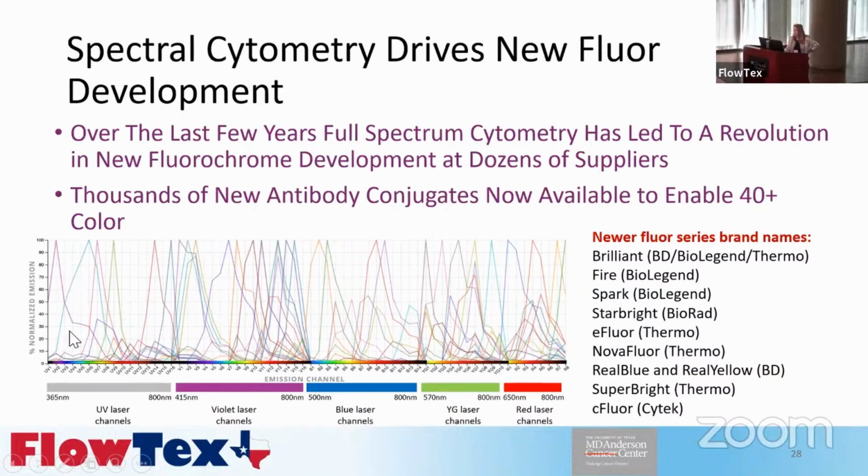And you can see that I'm fitting in quite a lot of dyes here. It wouldn't be obvious to anybody's eye that these don't overlap too much to be able to use together. So we're going to use some mathematical tools to help us believe that before we spend thousands of dollars. This is only possible because there's been a huge revolution in the number of dyes that are available over the last even 5 years. And there's new ones that I find every day. So a panel I designed 3 years ago, I think I could make it better today than I could have been, right? All the time.